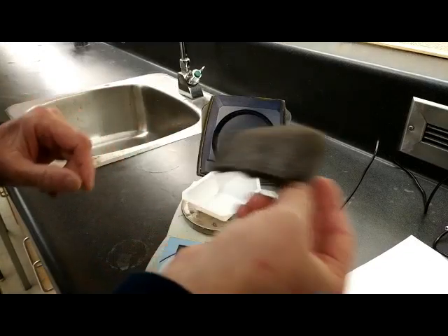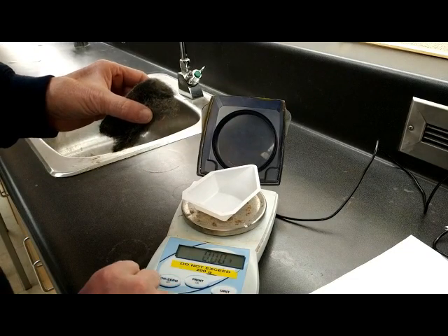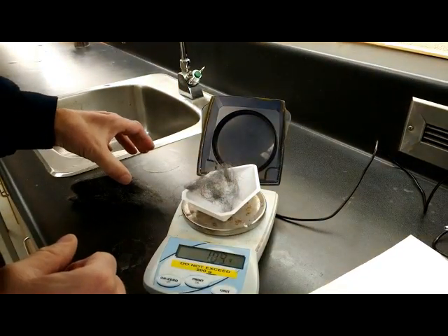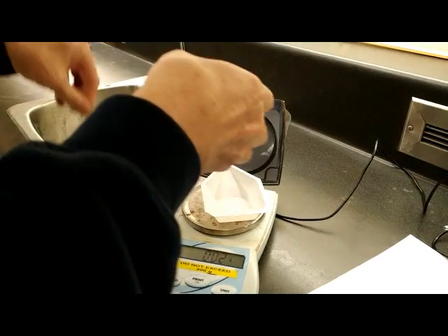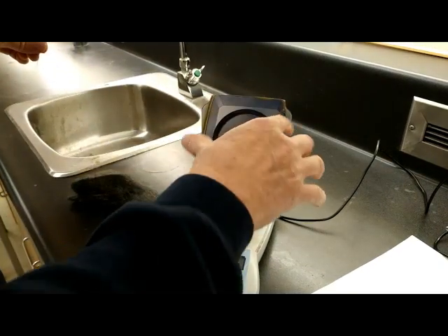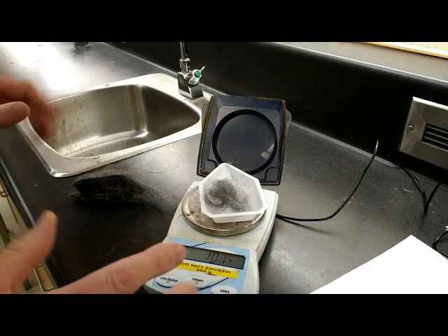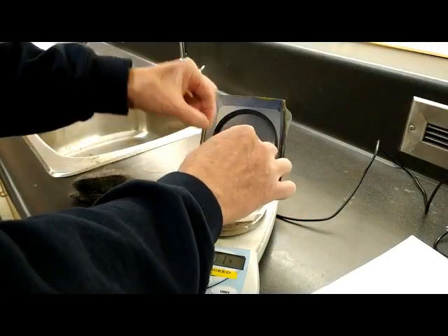Now we also need to add 1 gram of the steel wool. So zero that. And what we're going to do is pull this stuff apart. Wow, that was pretty good. Just a wee bit too much. No, just a wee bit, not enough. Oh, come on, really? There we go. 1 gram, right on. I think I'm breathing on it. Okay, I'm going to take this one to the stand.